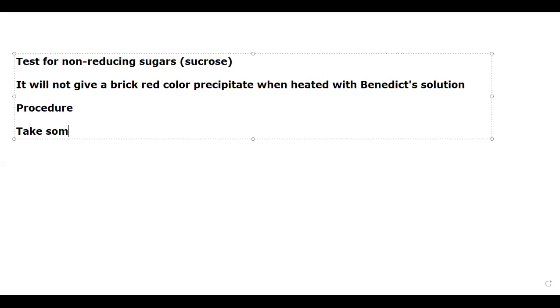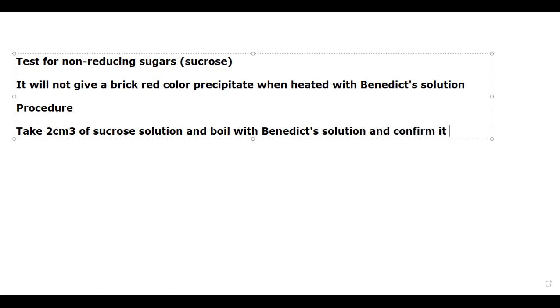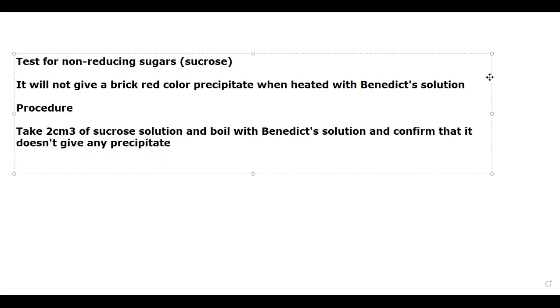Take 2 cubic centimeter of sucrose solution and boil it with Benedict's solution, and confirm that it doesn't give any precipitate.